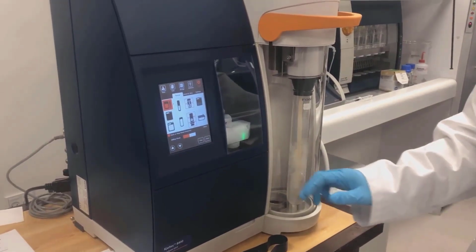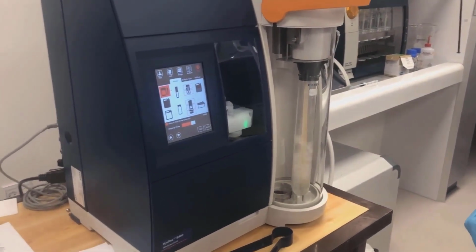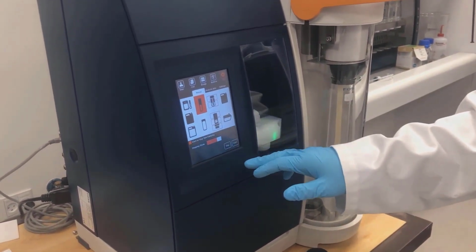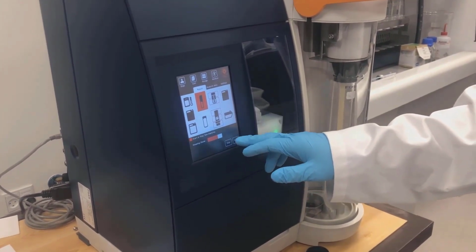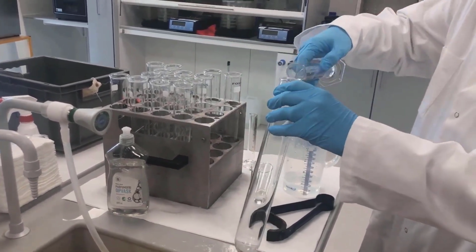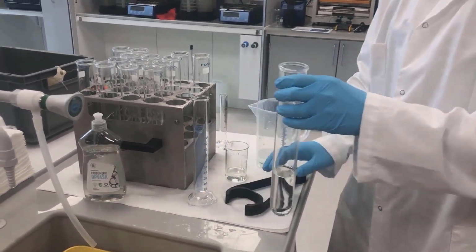Now after 5 minutes, you can stop the steam and drain the tube. We use another tube filled with 100 milliliters of water and do the cleaning. So now it's a distillation cleaning with water.